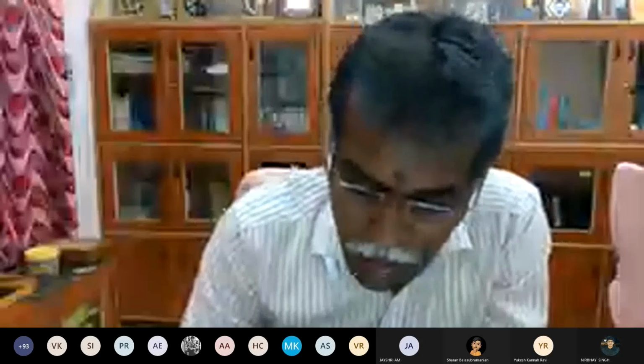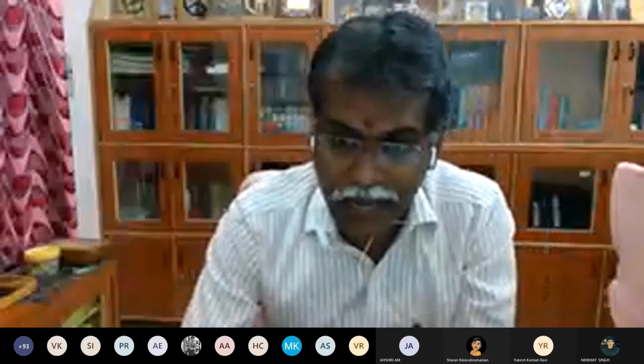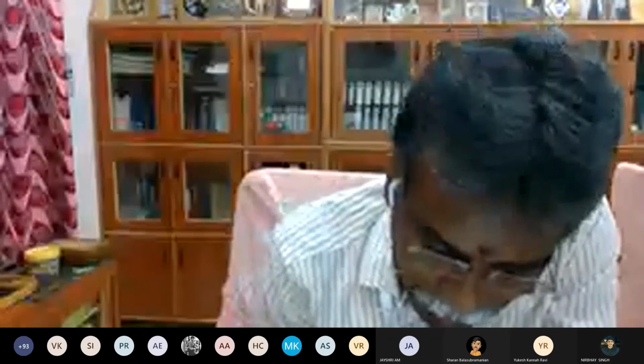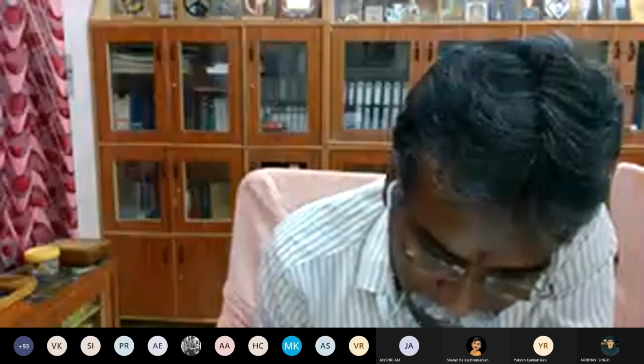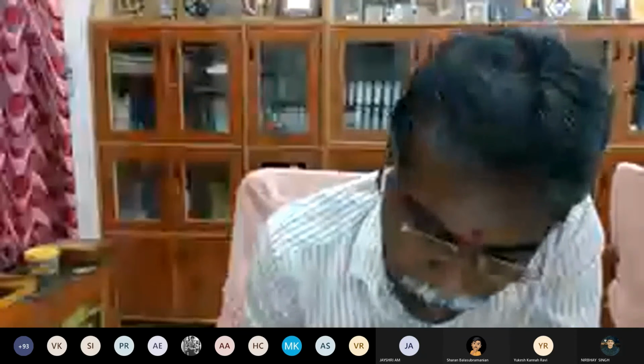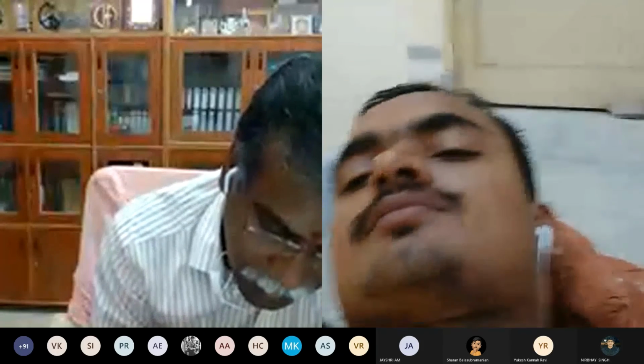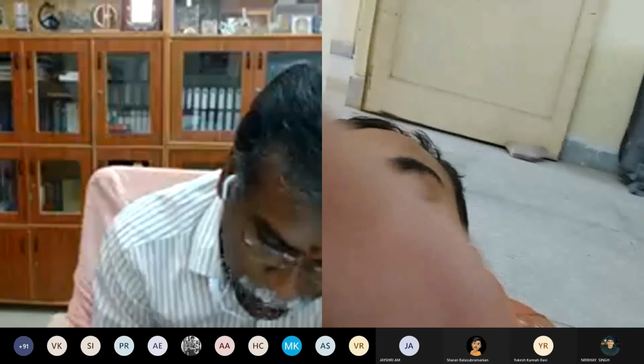Place the cuvette in the turbidity meter so that the vertical mark in the sample cell coincides with the mark in the turbidity meter. Please make a note. Let me draw this, that is important. Let me draw the top opening of the cuvette. For example, here, one mark will be placed here. You can also see one mark here. In the bottle there is one horizontal mark, and you can also see one vertical mark. Now you place the bottle inside, and this mark will coincide with this direction.